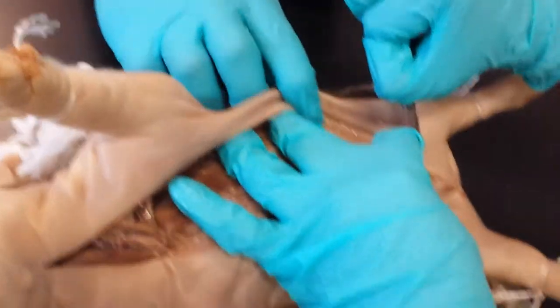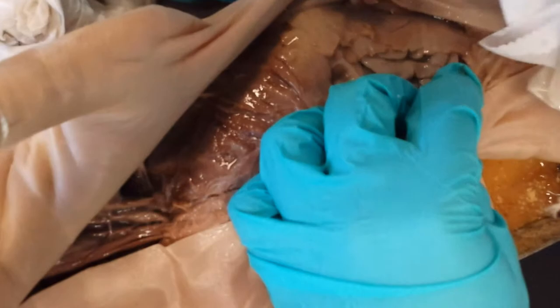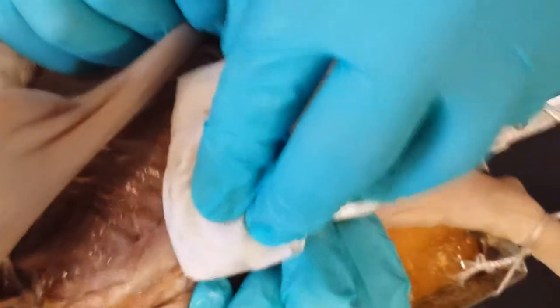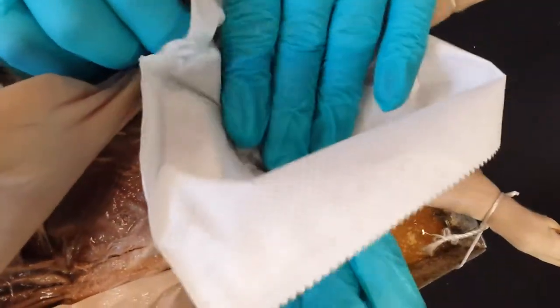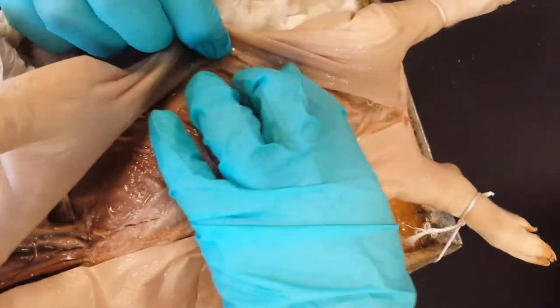Did I do it? Oh my God, it's the intestine. It did get juicy. He was right. He wasn't lying. Can you see it? Is this a small intestine? The big network of things? Yeah, it is. The large intestine will be the larger short one. And the small intestine will be the smaller one. This thing in the middle. You guys had it before already, so I think that was the liver. Oh, it was the liver. Or the stomach. And to the right of the liver.